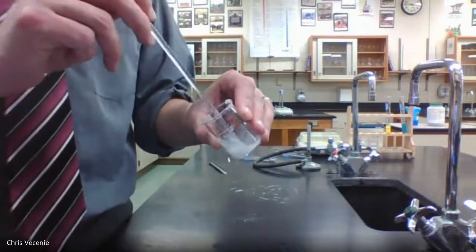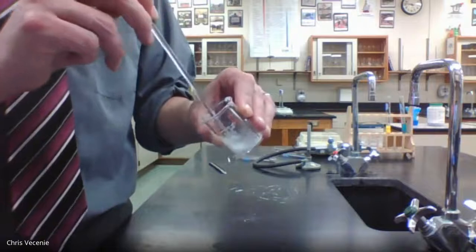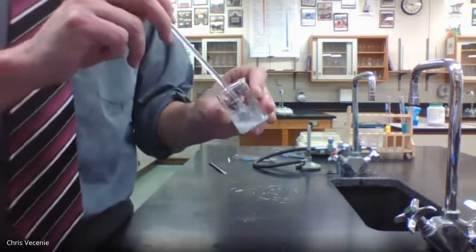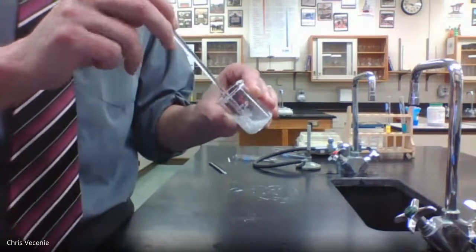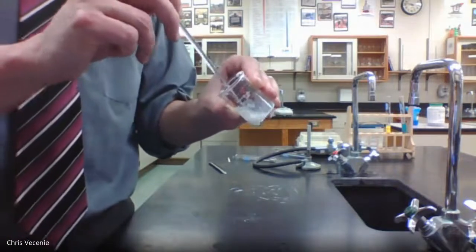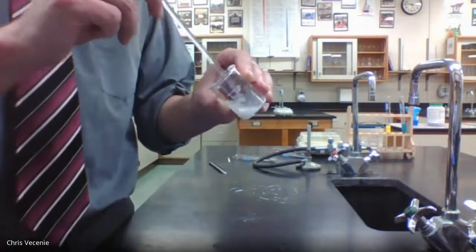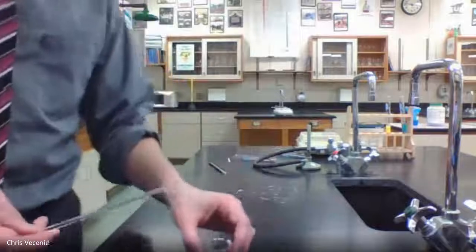What I'm doing right now is reaction 4B. The ash, which you guys hopefully have figured out is the magnesium oxide, is now reacting with the water. So it looks like we have that dissolved.